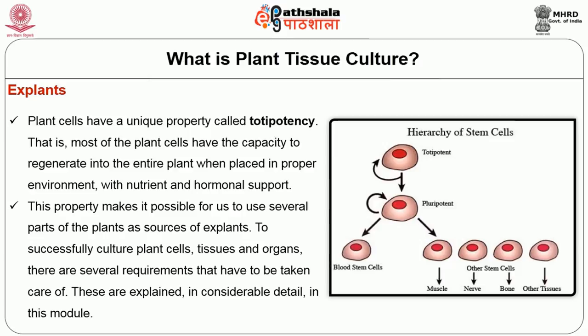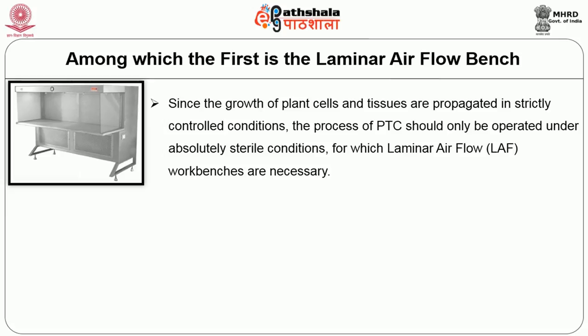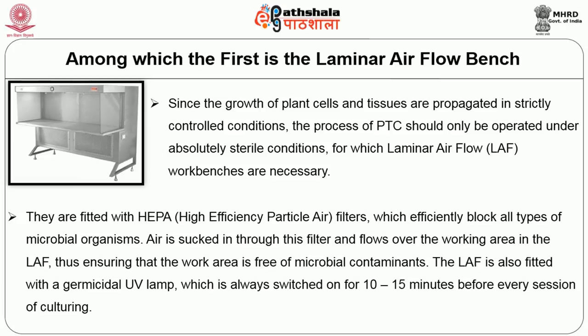Let us start with the laboratory requirements, among which the first is the laminar airflow workbench. Since the growth of plant cells and tissues are propagated in strictly controlled conditions, the process of PTC should be operated under absolutely sterile conditions, for which a laminar airflow or LAF workbenches are necessary. These are fitted with HEPA or high efficiency particulate air filters, which efficiently block all types of microbial organisms. Air is sucked in through this filter and flows over the working area in the LAF, thus ensuring that the work area is free of microbial contaminants.